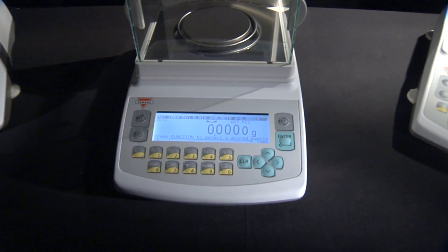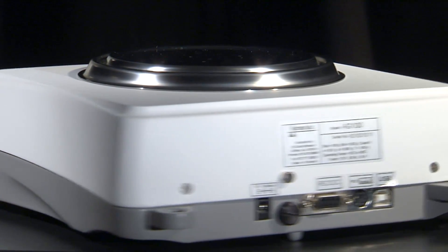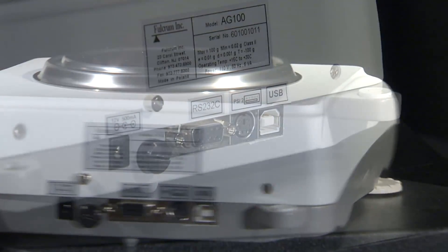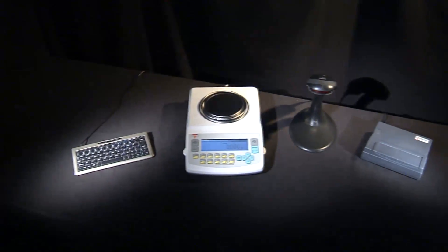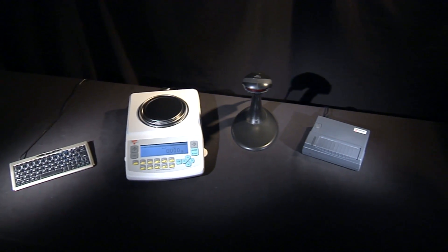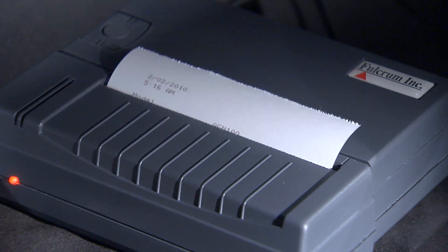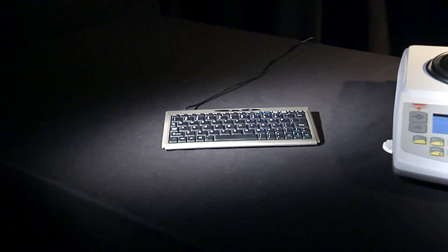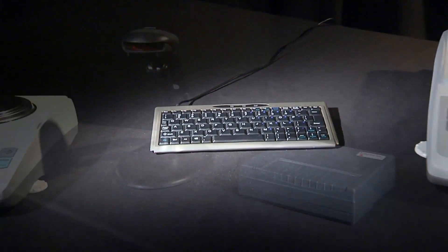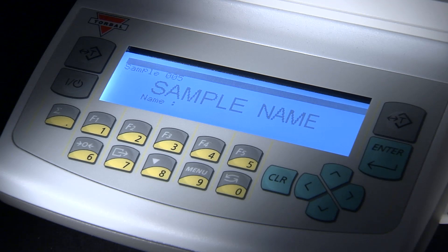Every unit is equipped with three communication ports — USB, RS-232, and PS2 — which offer complete flexibility when interfacing with a computer or other peripheral devices. The USB port provides fast data transfers to a PC, while the RS-232 is ideal for connecting the scale to a thermal printer. The PS2 port allows connection to an external keyboard for quick data input, as well as a barcode scanner to optimize the scale's database.